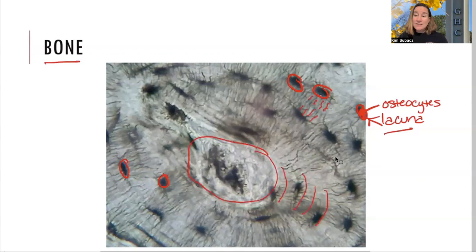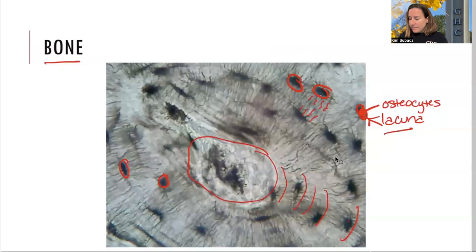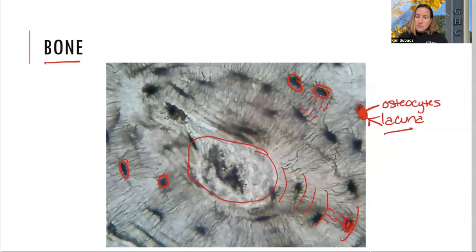We also have lamellae — little rings. When I'm looking at compact bone, I think it looks like a tree trunk, because tree trunks have those annular rings. So we've got lamellae, that's the lacunae, and inside the lacunae is a little osteocyte. Connecting the little lakes are the canaliculi that connect each one to each other through these little rings. That is compact bone.